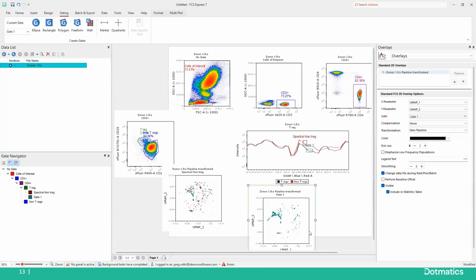Are these features also available in the IVD version? Yes, they are. So what I'm doing here, the IVD version has all of the permissions. So that's really the only thing that you would be doing with that. You would just have to make sure whoever's doing it has the proper permissions. Okay. So this is if the data was unmixed.